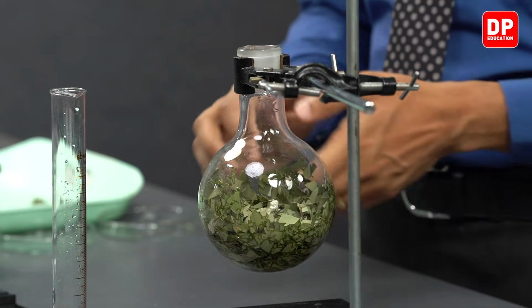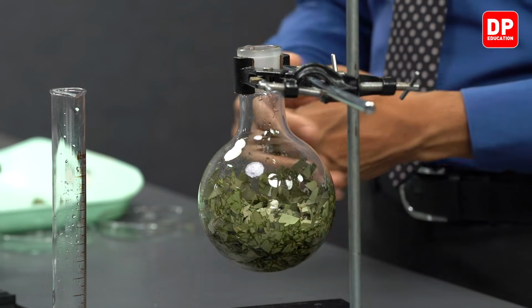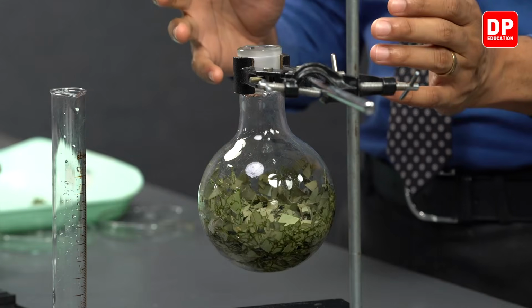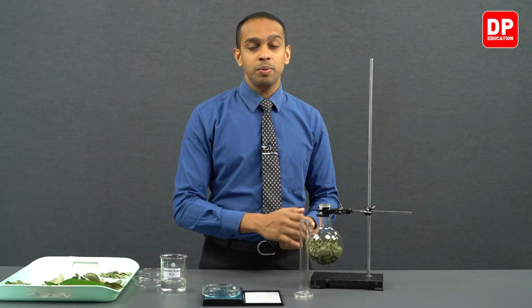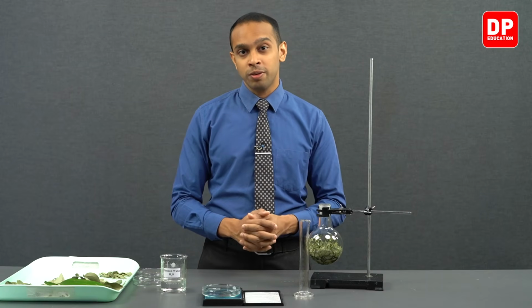Now students, we have included all of our cut pieces of cinnamon leaves here. Apart from that, we have added 100 milliliters of water into this round bottom flask.